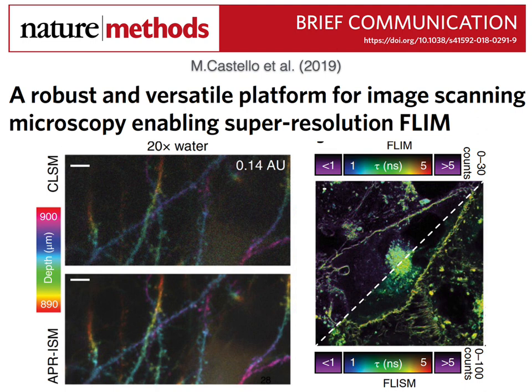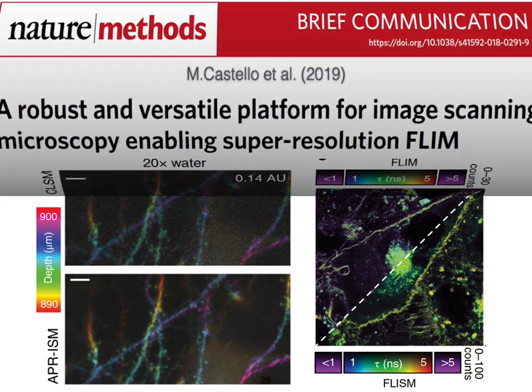Hopefully, you remember one of my very first slides about the fact that not only are the fluorescent molecules pretty, but they are able to change their emission, including the lifetime, as a function of what's going on around. So really, you can perform spectroscopy, forming an image with this kind of information, forming an image in a super-resolved way.